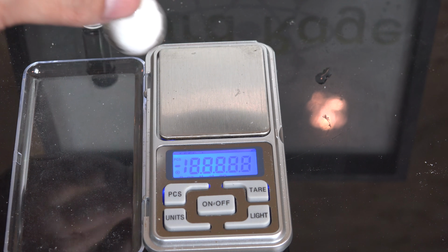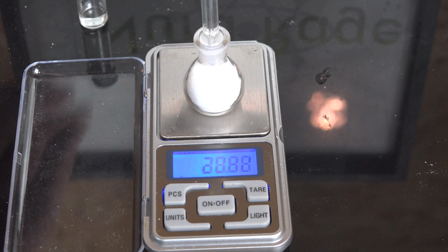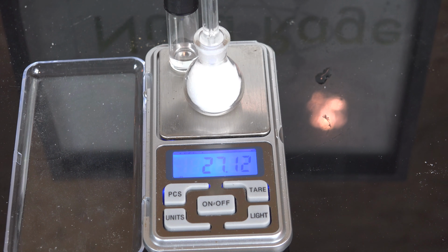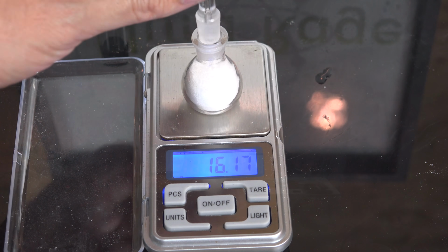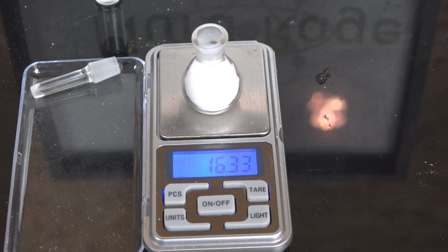I'll be showing that in this video where we go back to the chemistry equivalent of burger flipping, analytical chemistry. I'm sure all of you are absolutely overjoyed with enthusiasm for today's topic, measuring density. If boredom and tedium is a torture in hell, then welcome to my personal circle. I have a special personal hatred of this topic because I had to measure 500 samples in 1 hour one time. Anyway, this video is going to be more lecture than entertainment, so turn off now if you're not a chemist, or if you're a computational chemist.